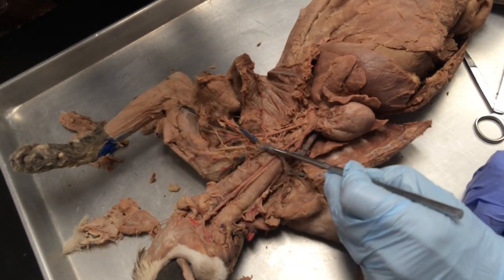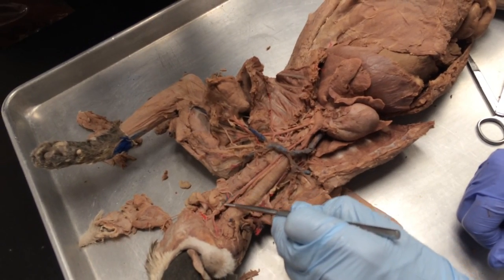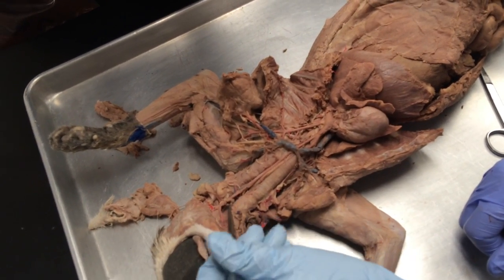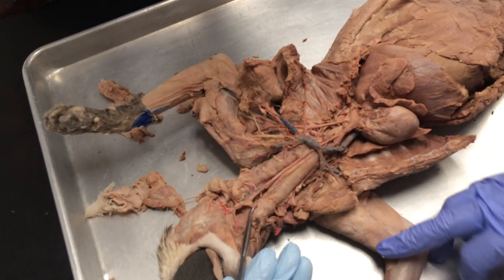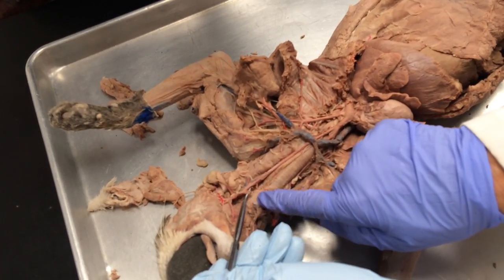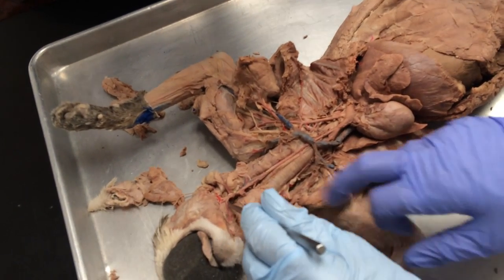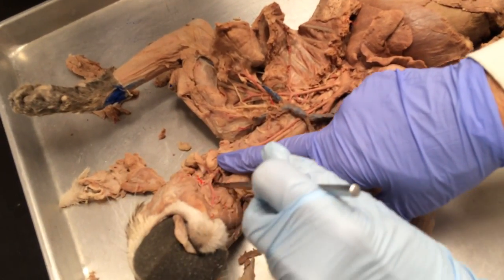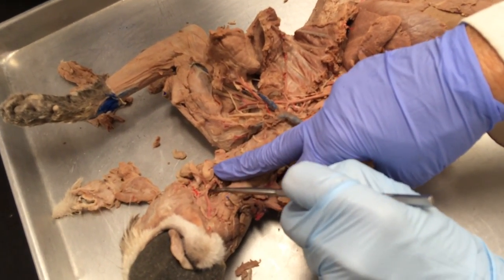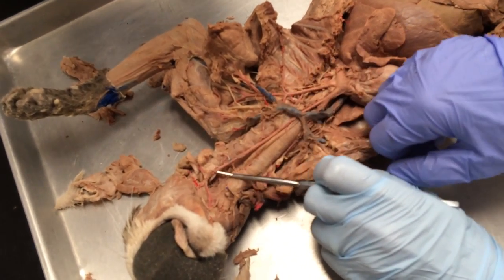Now we're going to come up this left common carotid, and the first branch we got off here, that is the superior thyroid, and the thyroid gland would be sitting right here. Okay? And then the next branch is a very deep branch, which is way inside there, and that is the internal carotid. Watch your hand.